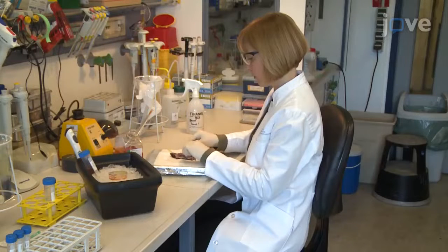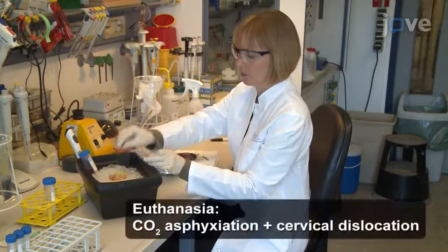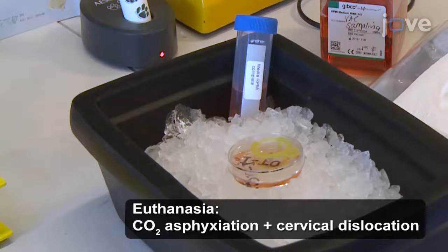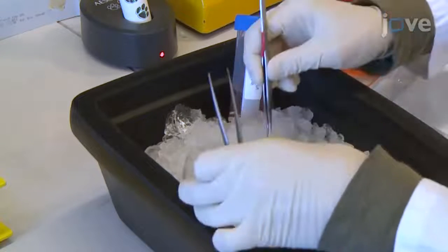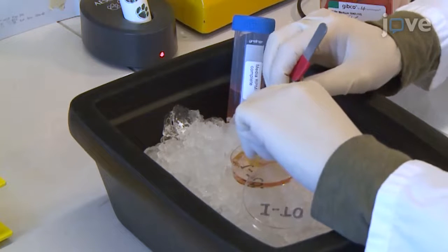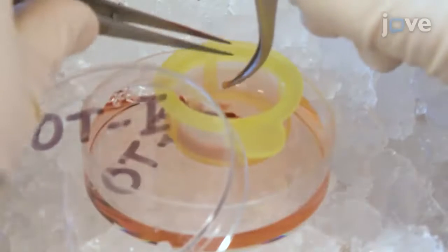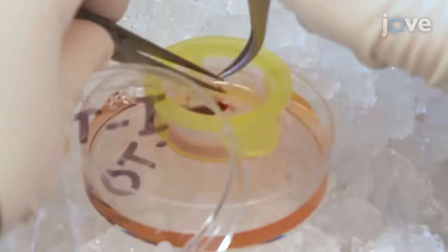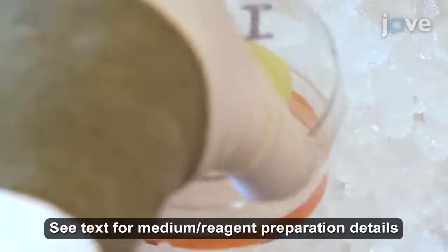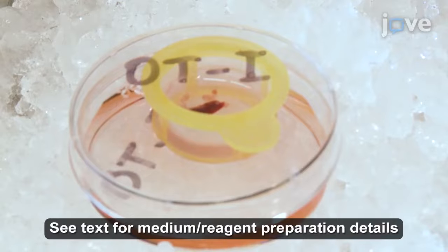To isolate Thy1.1-positive CD8-positive T cells from OT1 mice, first harvest the spleen and inguinal, axillary, and cervical lymph nodes according to standard protocols, placing all of the organs into a 100-micrometer pore mesh strainer in a 60-millimeter petri dish containing 3 to 5 milliliters of complete medium on ice per mouse as they are collected.